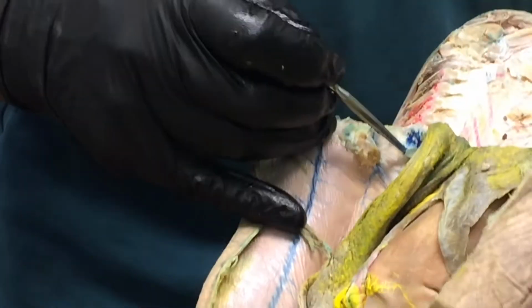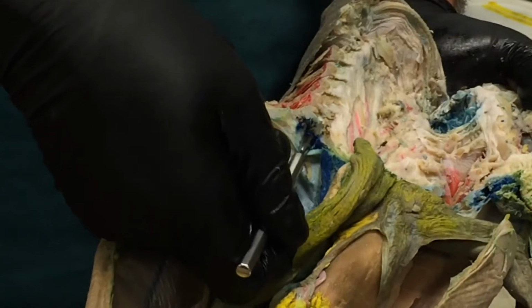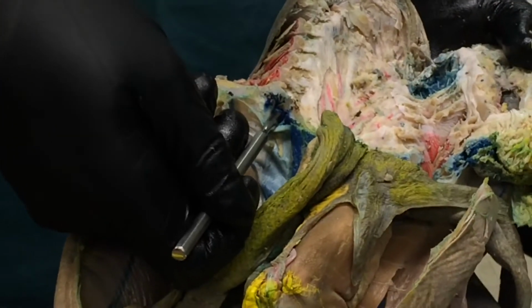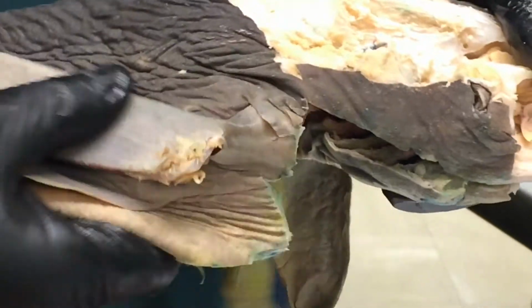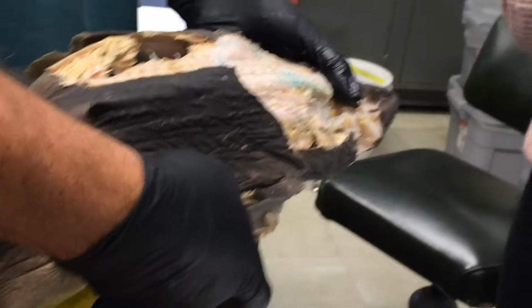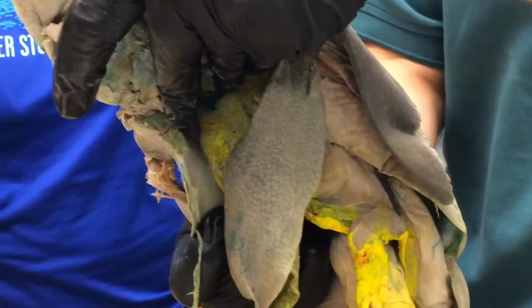Anterior cardinal veins or sinuses we can find if we put a probe forward from here, like this. And that space that the probe is in is the anterior cardinal sinus. And it's the same space that we saw previously where the dorsal and lateral interarcuals are. You can see where the probe is coming out here if I look dorsally. And that's the anterior cardinal sinus. Okay, so it's this big space just above the gills.